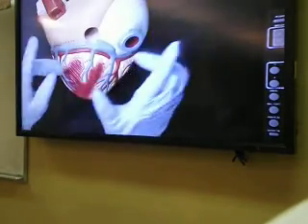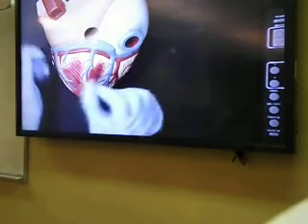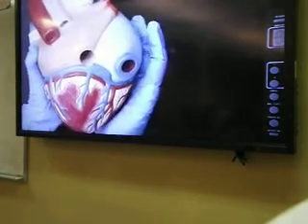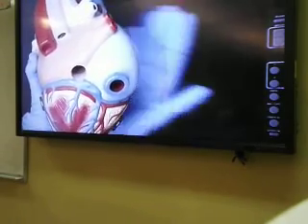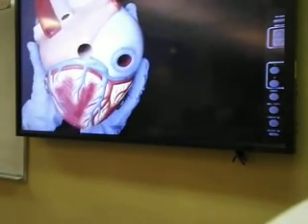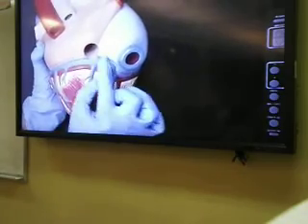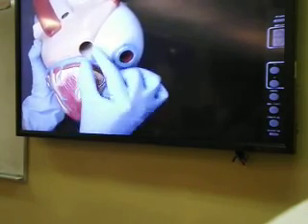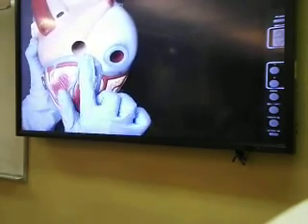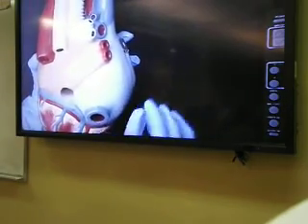But the only cardiac vein, or big cardiac vein, that you need to know is actually on the posterior aspect of the heart. Very close to the right atrium, you see this thick looking vein which we call the coronary sinus, and this coronary sinus is made by the fusion of all the cardiac veins: great cardiac veins, small cardiac veins, and middle cardiac veins. So together it makes the coronary sinus, and the coronary sinus will take all the carbon dioxide from the heart muscle or myocardium and will drain into the right atrium.